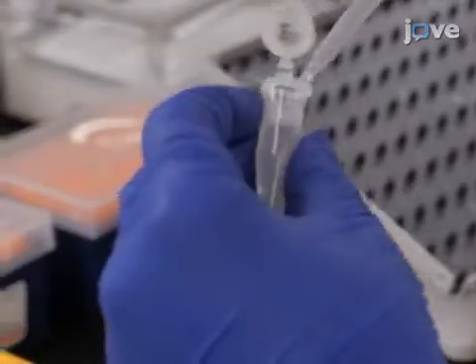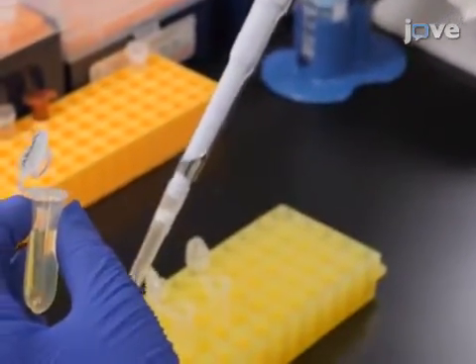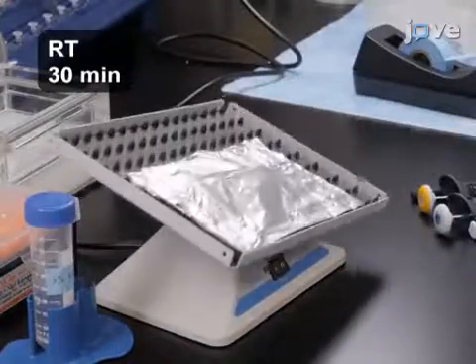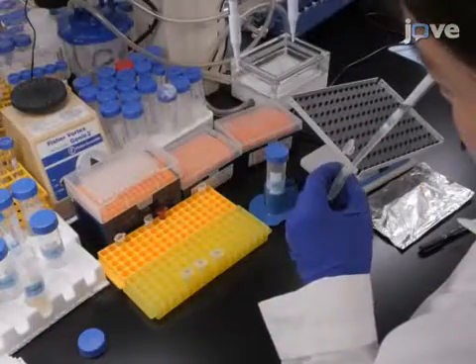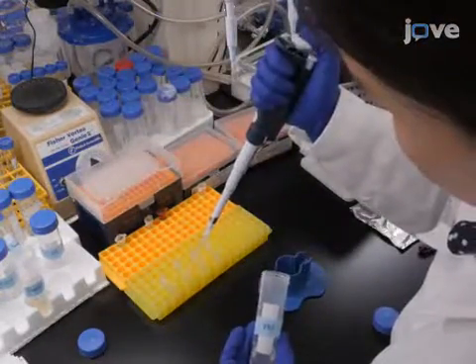Remove the BSA solution from the samples and add 0.5 milliliters of the EDU reaction cocktail to each tube. Incubate the samples at room temperature for 30 minutes with gentle rotation, protecting the samples from light. Finally, wash the samples once in 1 milliliter of 3% BSA in PBS and then wash once in 1 milliliter of PBS.